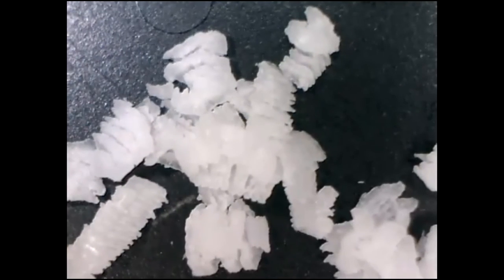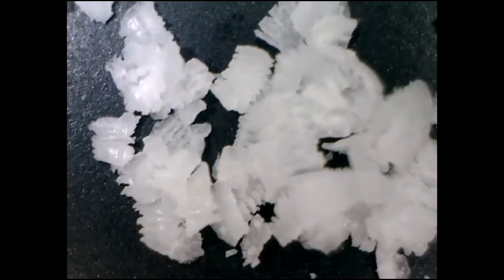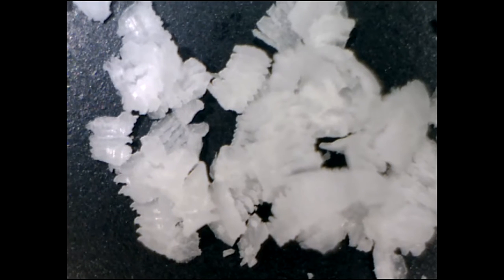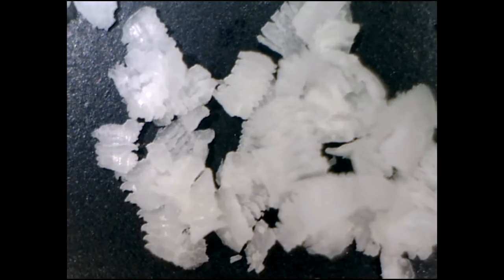Okay, so now B is right next door. That's a good one. It's definitely less shiny. This one here, you can't really tell. If I try to crush it, it's very sticky, if that's a highly scientific word. It doesn't really crush very well. It just sticks to itself if I try to crush it. A little soft. It's definitely not as hard. It's softer. And also white though, also a white solid.